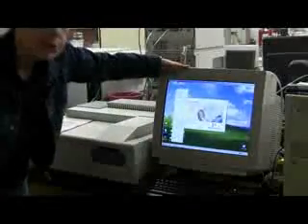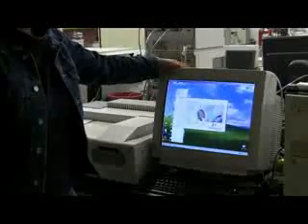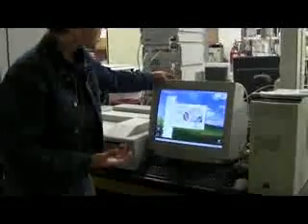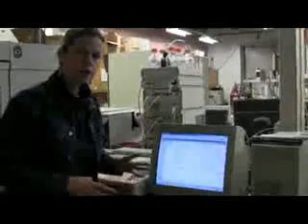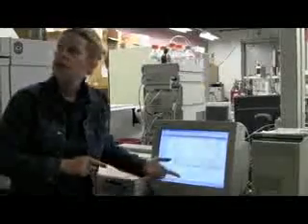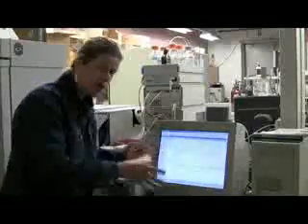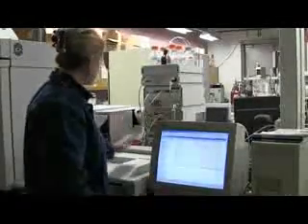Now, here's the bad news about this thing. It came from a pharmaceutical company, and this will be your first experience working with data systems from a pharmaceutical company. This is the bad news, is that every single thing you do has to be specially recorded. And every time you try to save something, you're going to have to put the password in again. Okay? The password analyst and student109, you have to keep putting that in every time you want to do things. All right? And it wants to save everything.